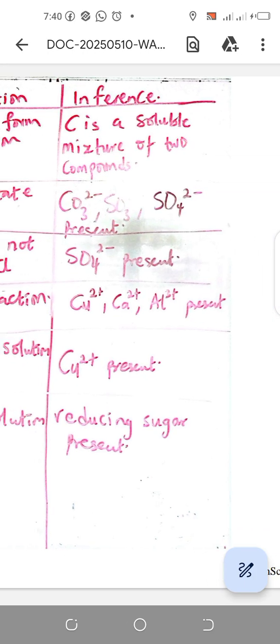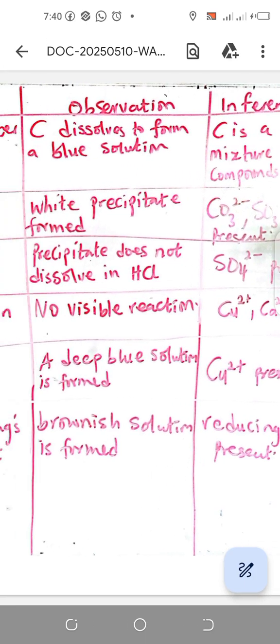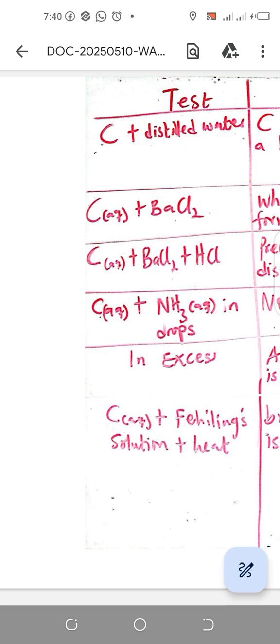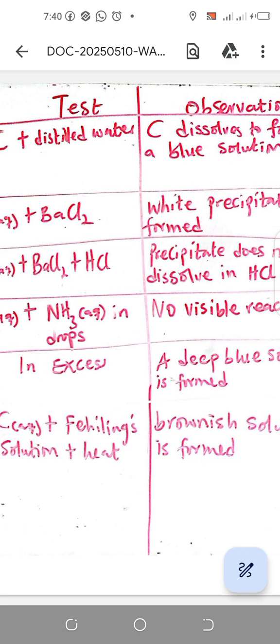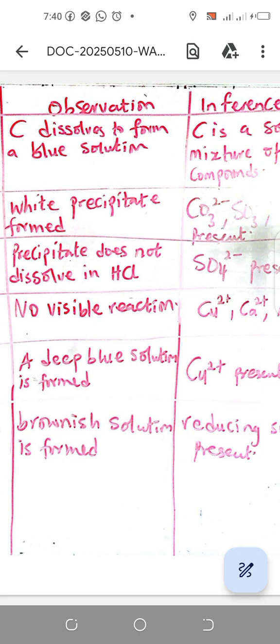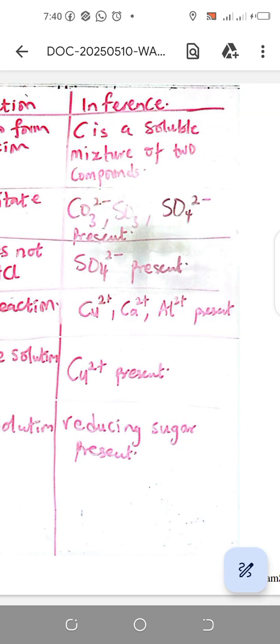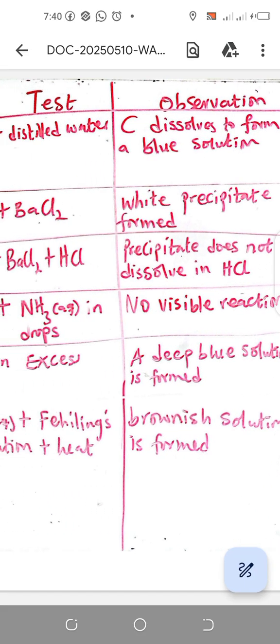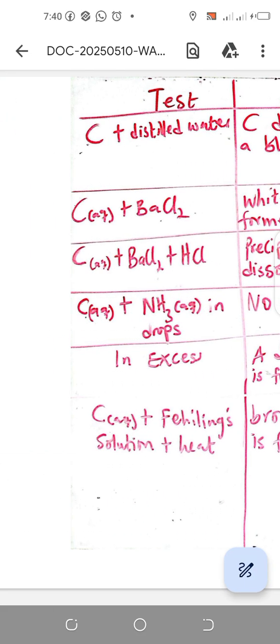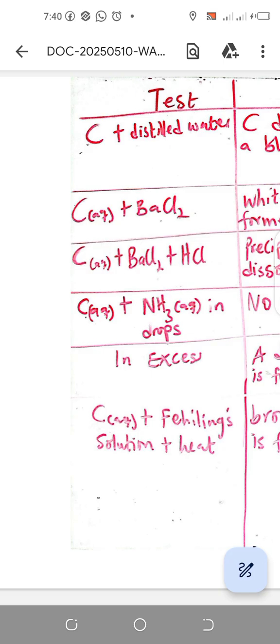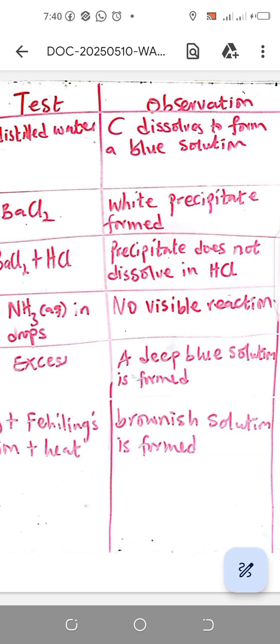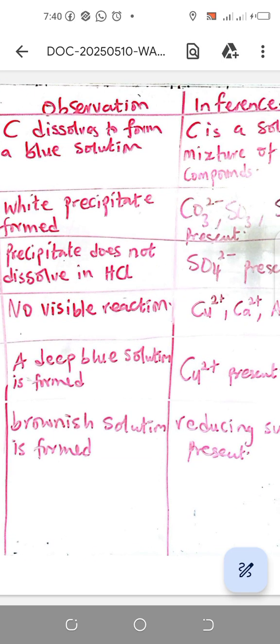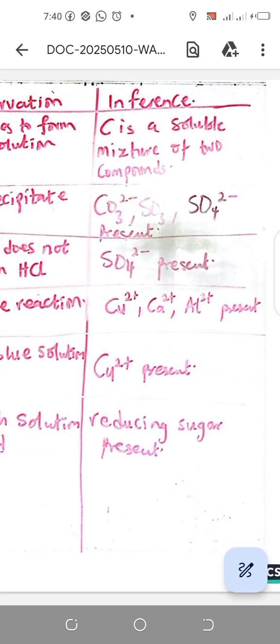Another test is C aqueous plus ammonia in drops. We see no visible reaction, and we can conclude probably it would be Cu^2+, Ca^2+, and Al^3+ that might be present. If you add this in excess, you would see a deep blue solution that confirms copper.